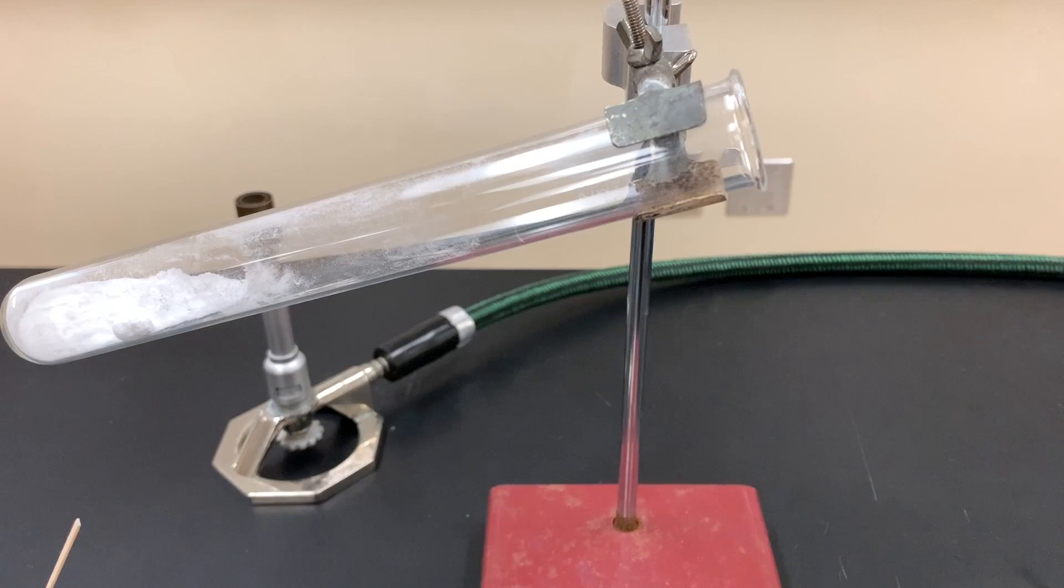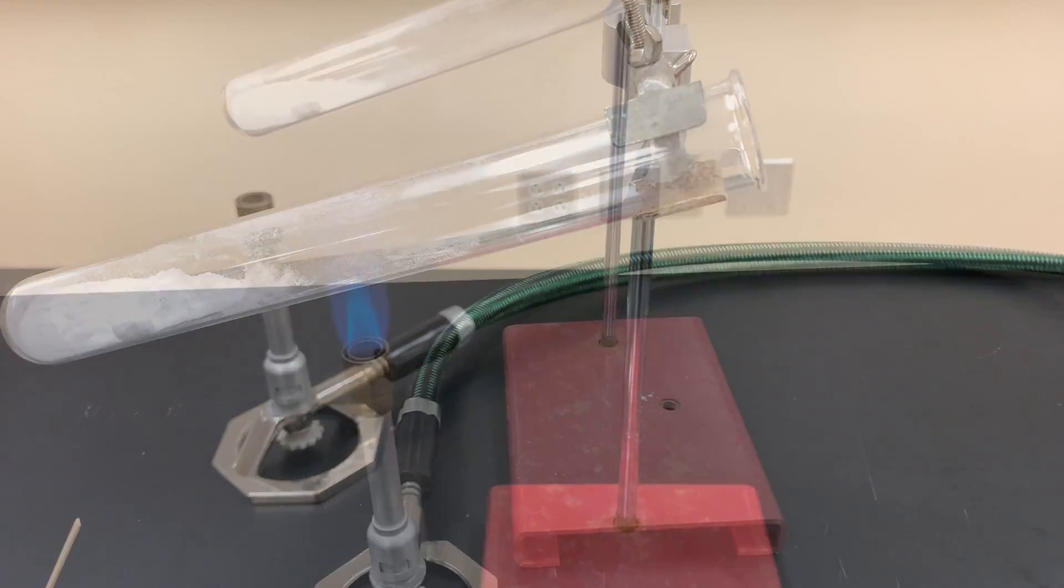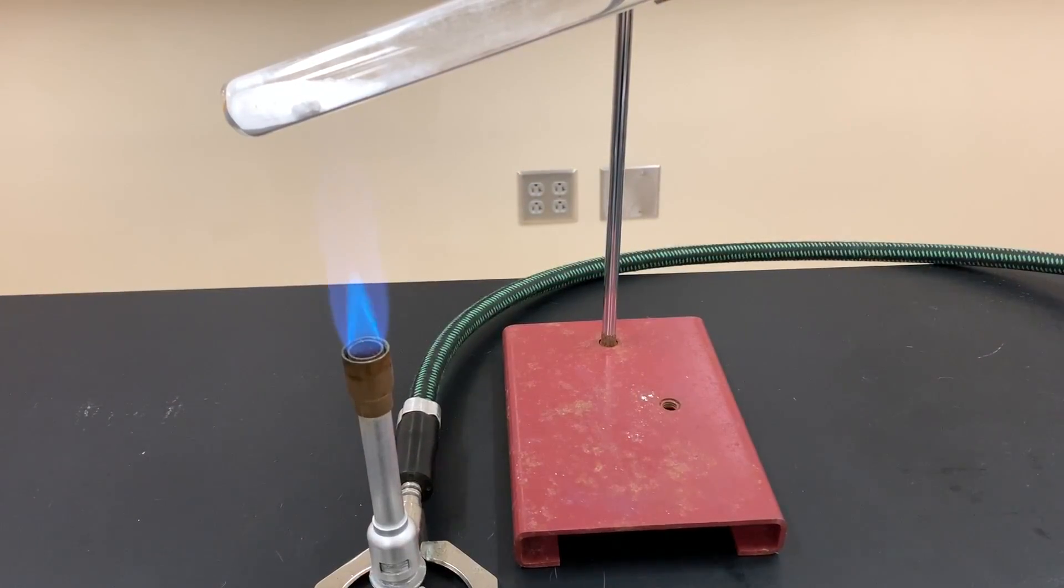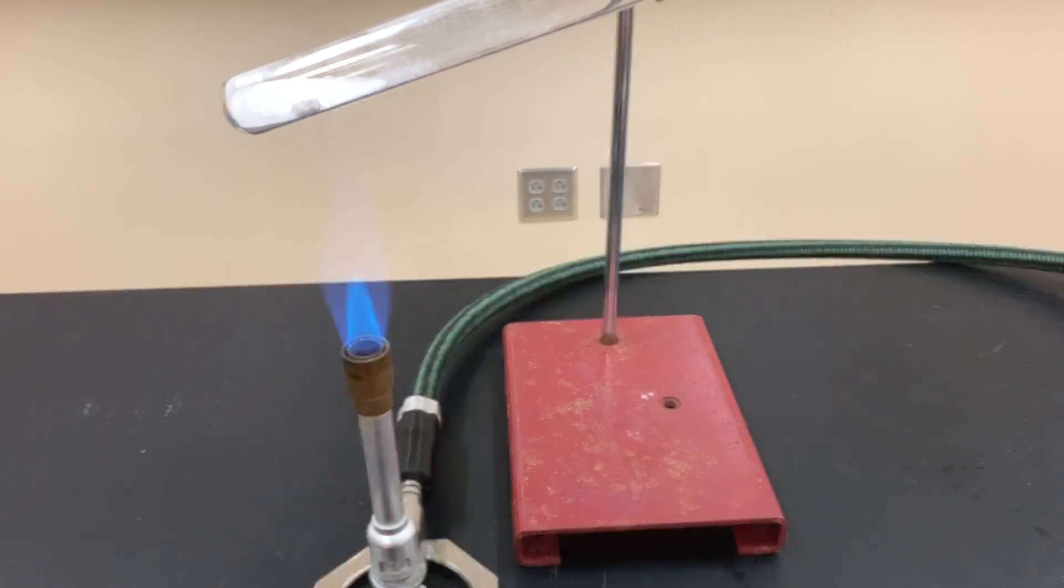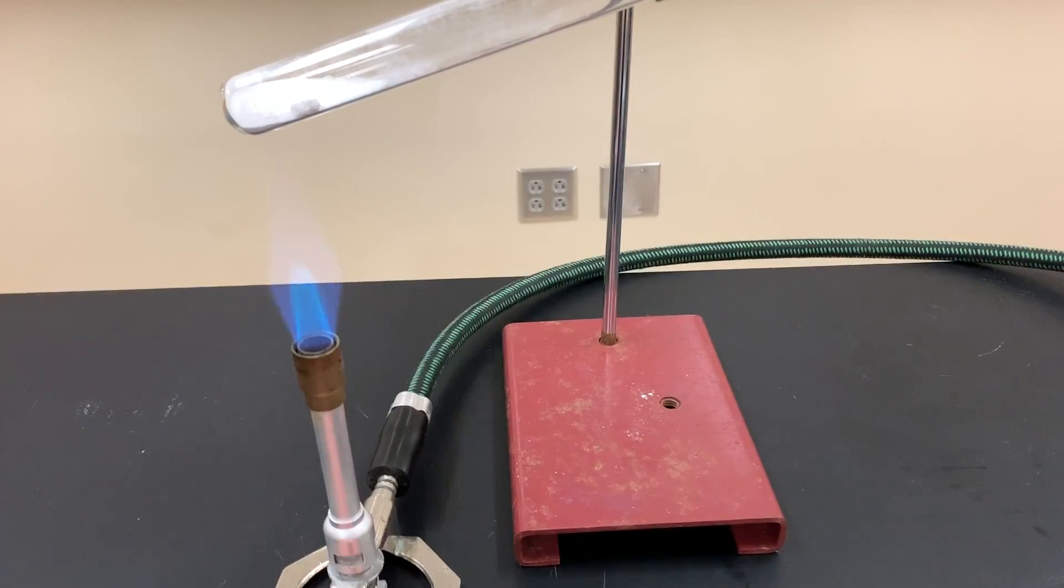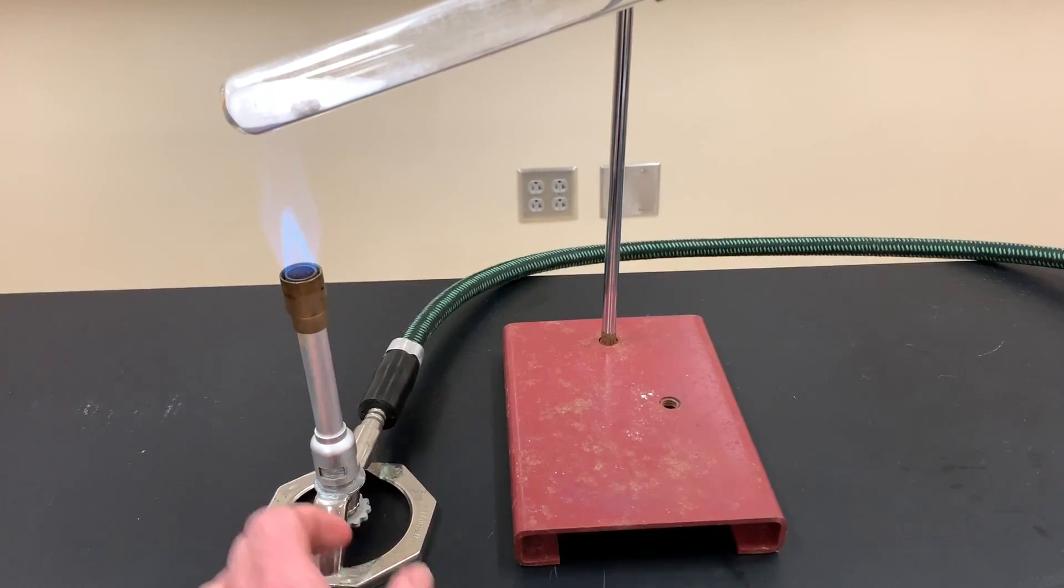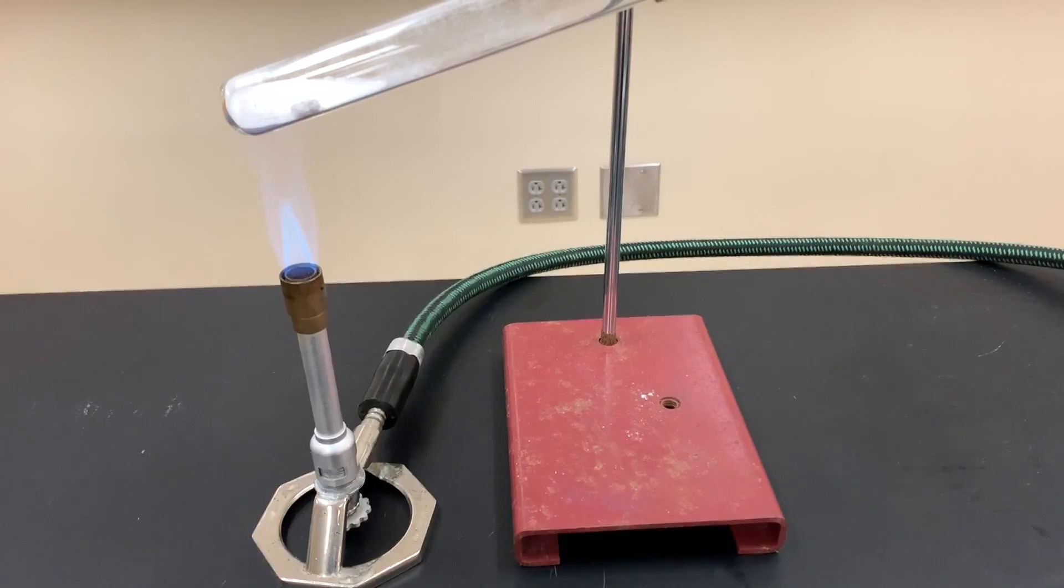The next step is to light your Bunsen burner and have an inner and outer blue cone flame like that at kind of a low heat or medium heat first. You're then going to take your Bunsen burner and put it underneath the end of the test tube. So you're going to heat this test tube for about 10 minutes, start with kind of a low heat looking for any kind of chemical change that you are looking for.